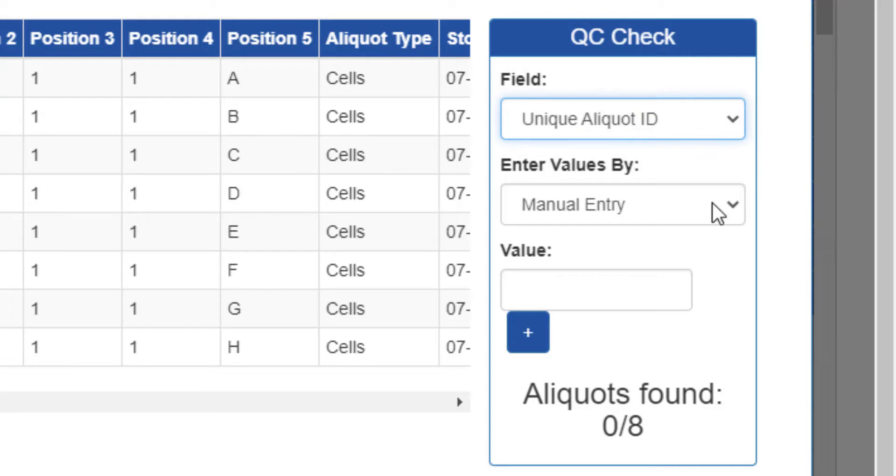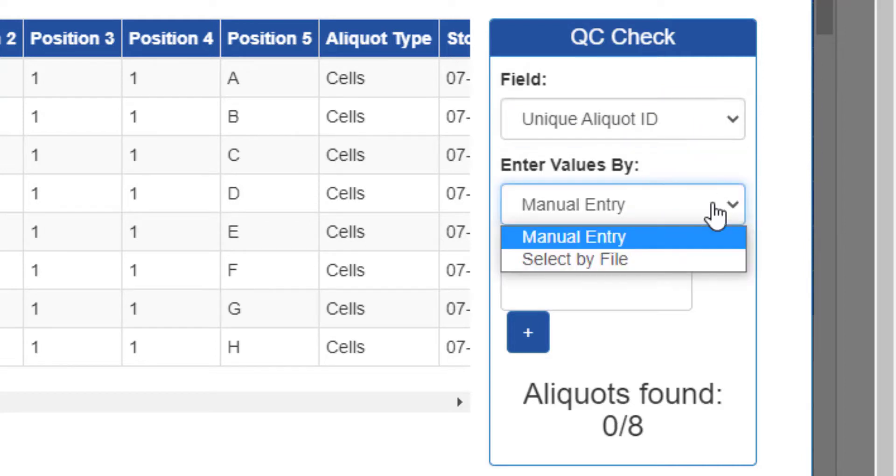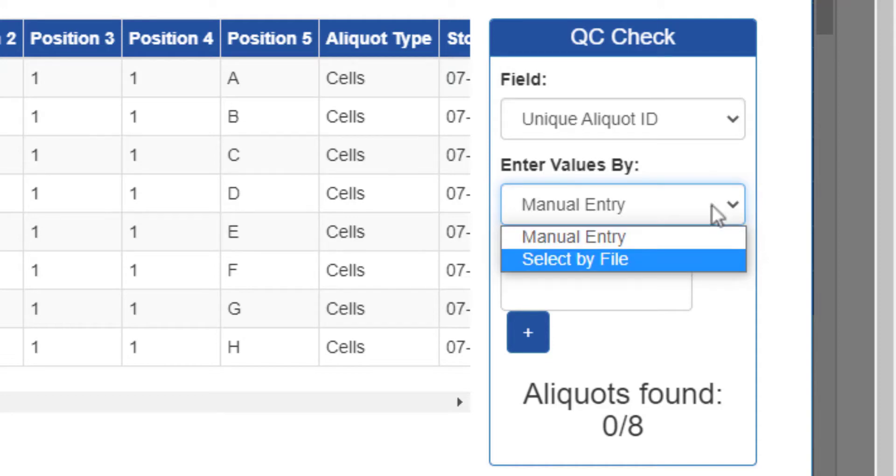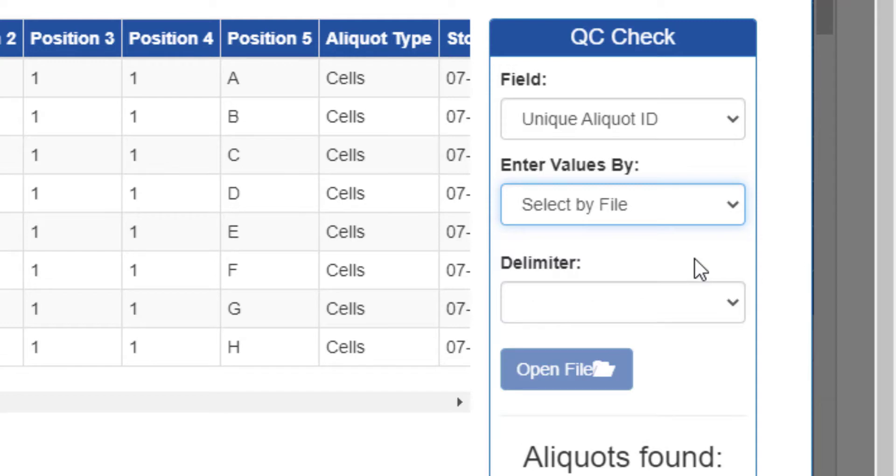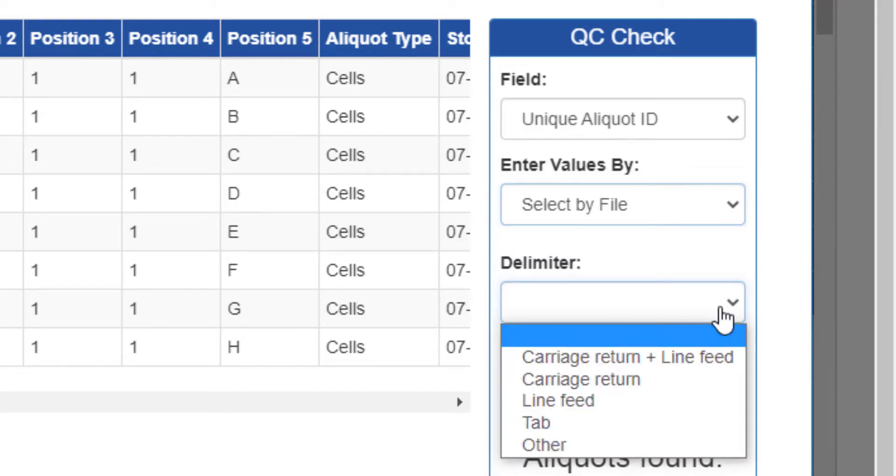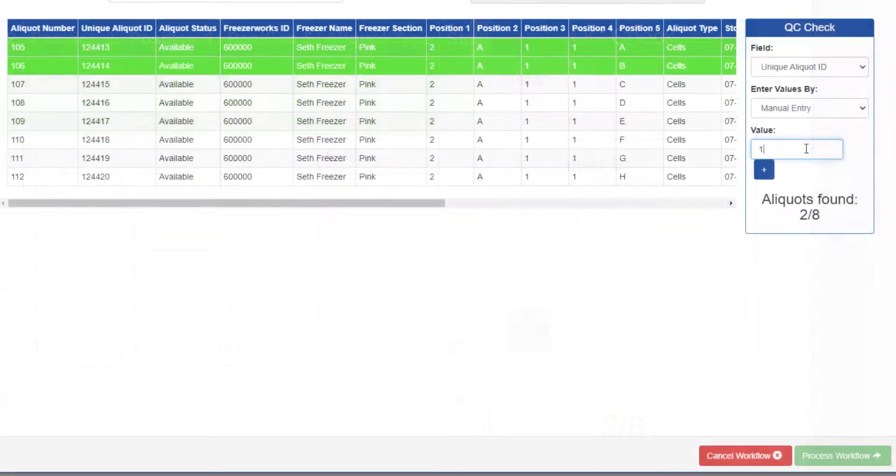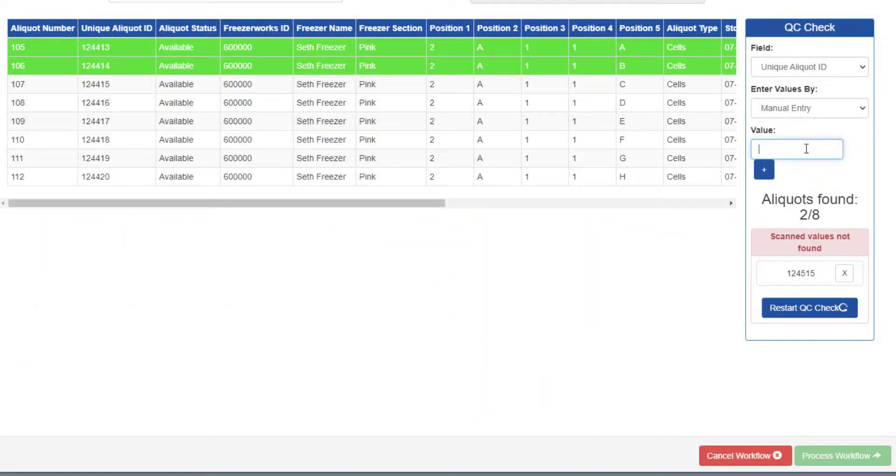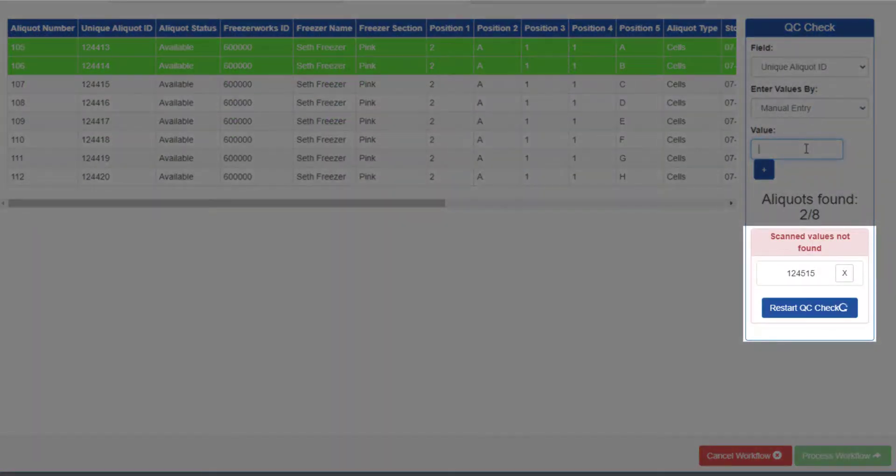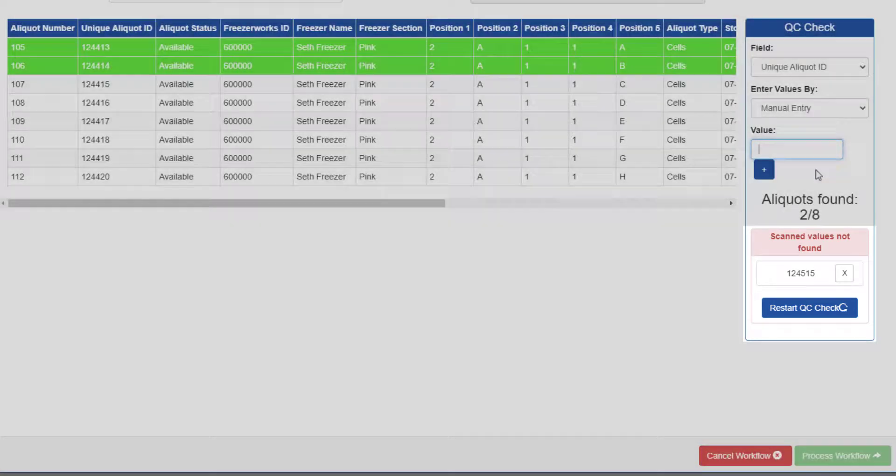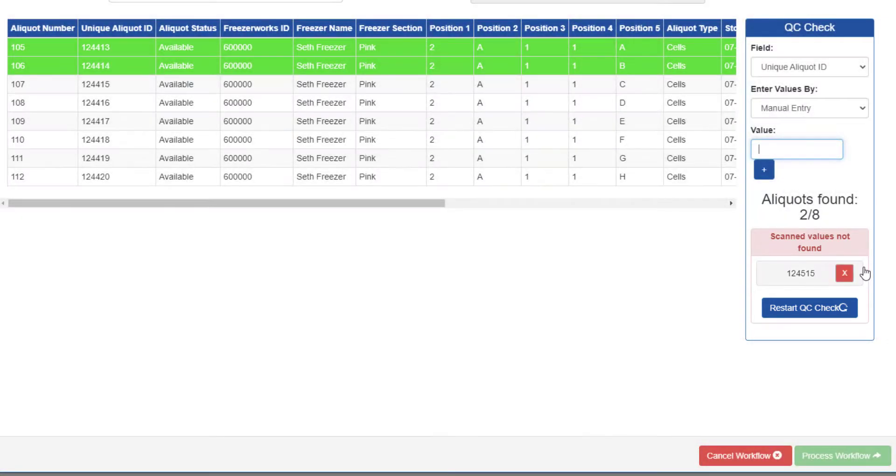You can either check using manual entry, with a barcode scanner for instance, or using select by file, however your organization operates. If you choose select by file, you will need to provide the delimiter your external file uses, i.e. what separates the data. If any of the values you enter are incorrect, the program will let you know, and you can remove the incorrect values or just restart the whole process.